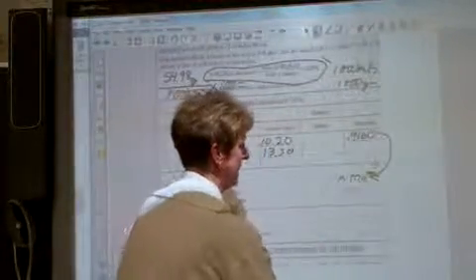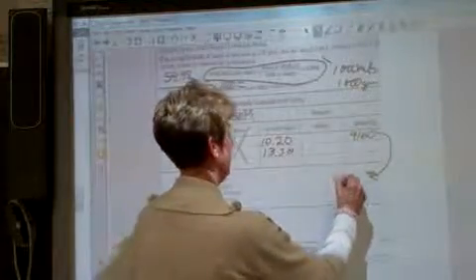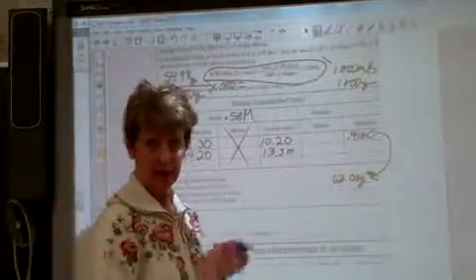Error. Okay. Little error. What's the mass of C2? 24, and 16 times 2 would be 32, plus a few hydrogens. Fix that number there. That should be 60.00 grams. Okay. Now, what we're looking for next is the mass of acetic acid per liter of vinegar.